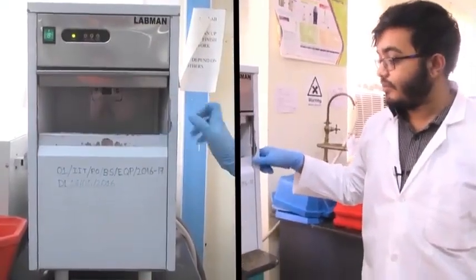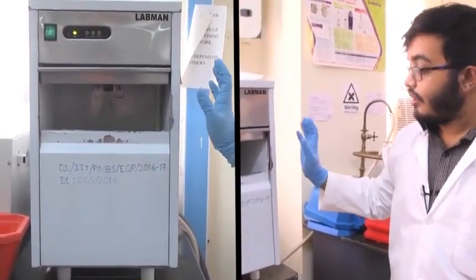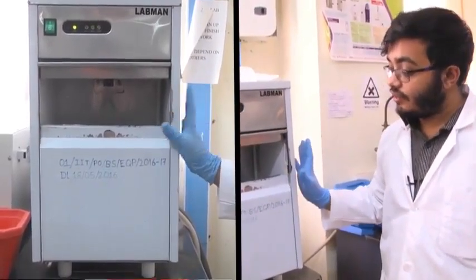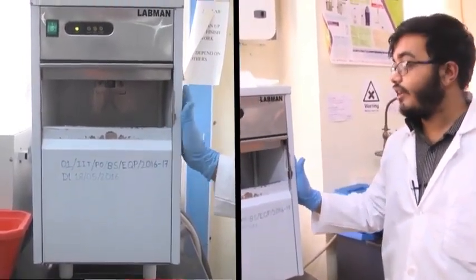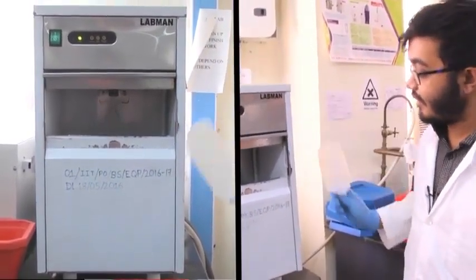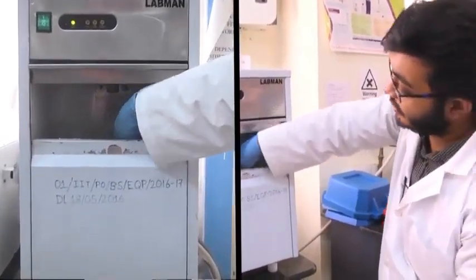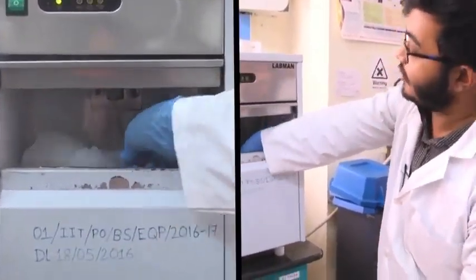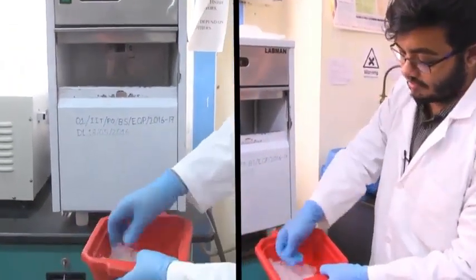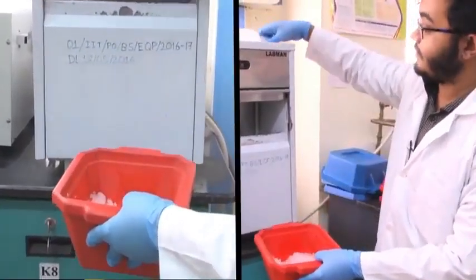For certain experiments, it is necessary to carry out the reactions under ice cold conditions. For that we need ice makers or ice flake machines. So this small instrument here does exactly that. It is connected to a water supply source, and what it does is it creates flake ice for us. Let me just show you. As you can see, I just took out some ice, flaked ice which we take inside these ice buckets.